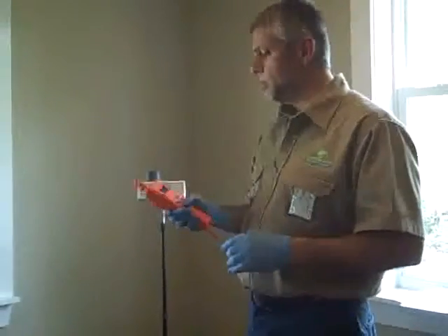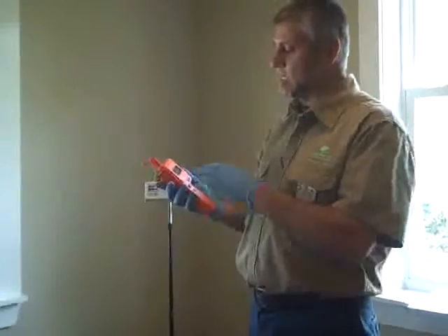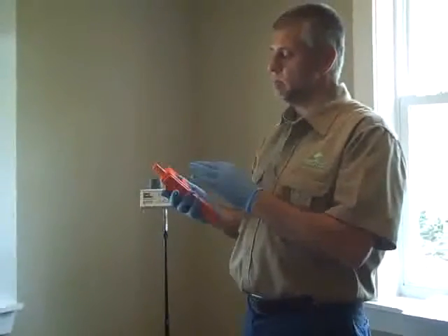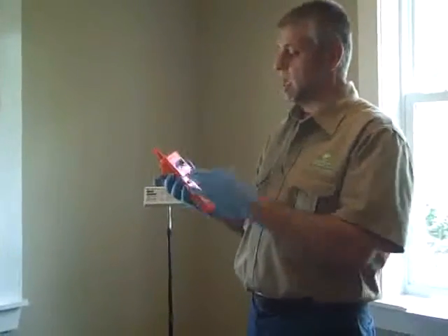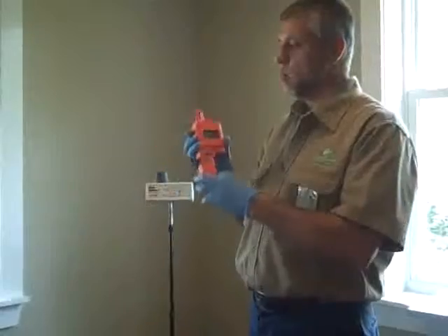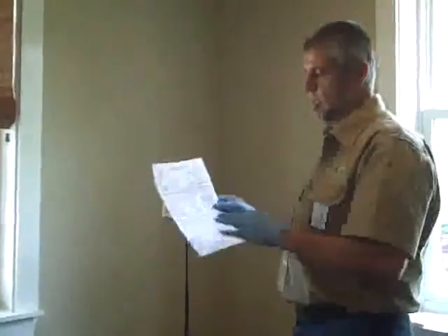So what I'm going to show you is, this is our digital hygrometer. And what I like to get is somewhere 55, less than 60% relative humidity. It also tells the temperature. And what we do is we document that. We would put this on our chain of custody.